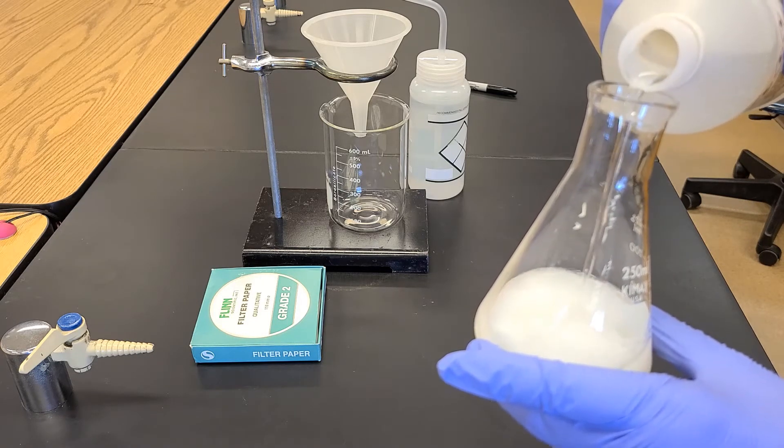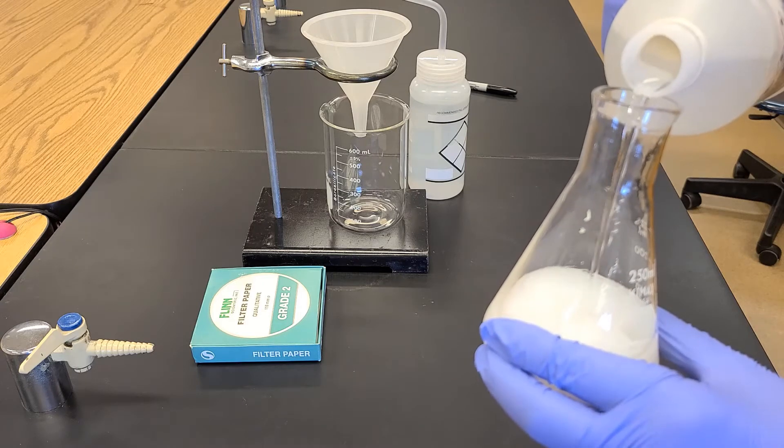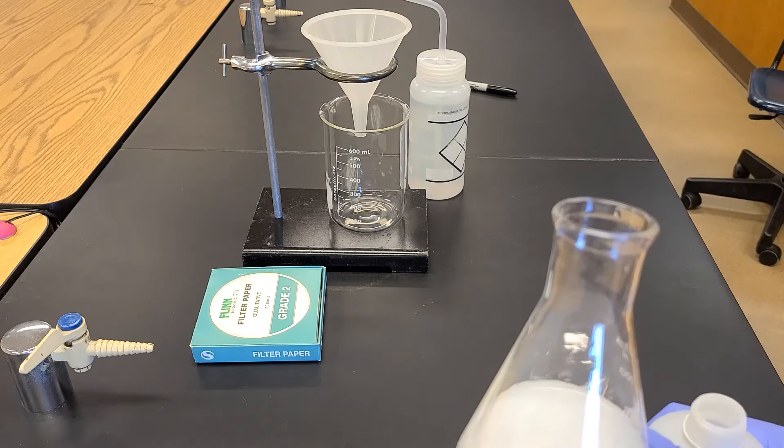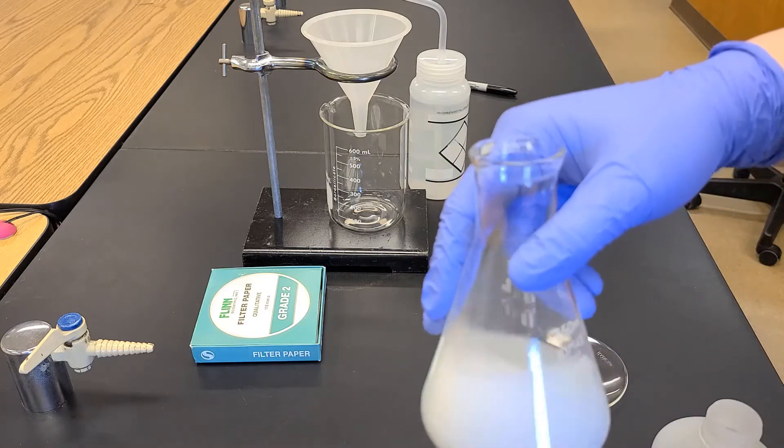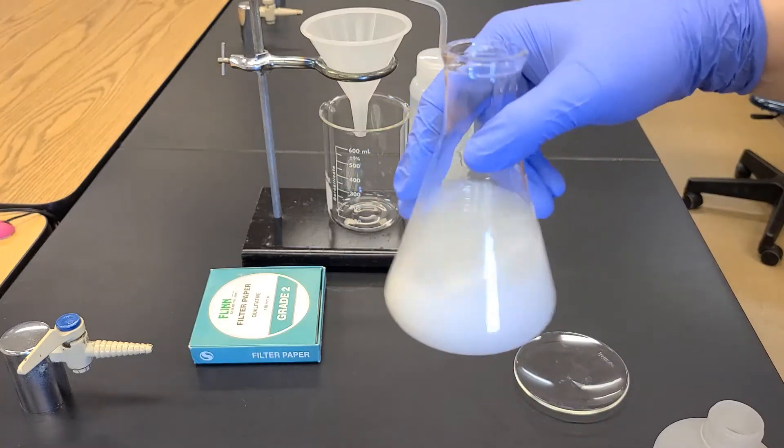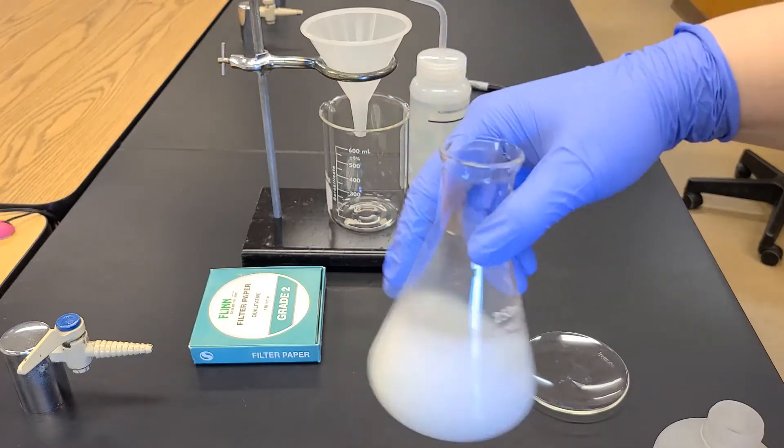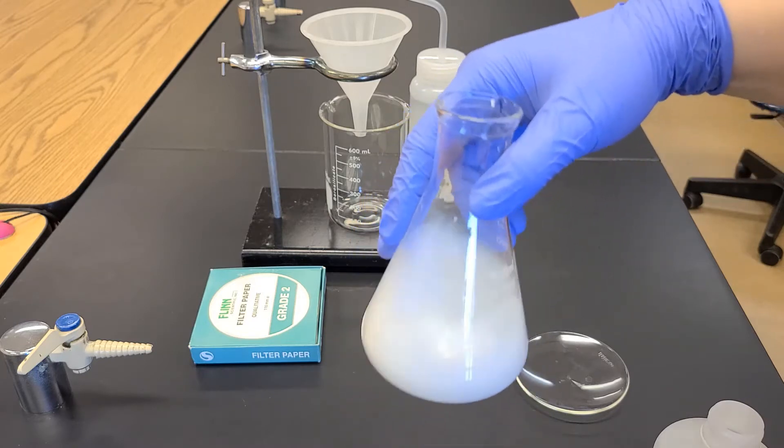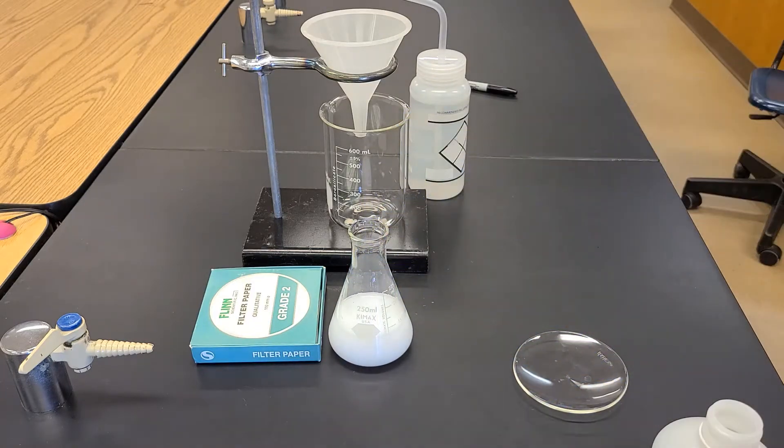I'm adding some sodium carbonate solution, which is forming the precipitate calcium carbonate. I'm swirling my reaction mixture just to make sure everything is reacted and mixed together well.